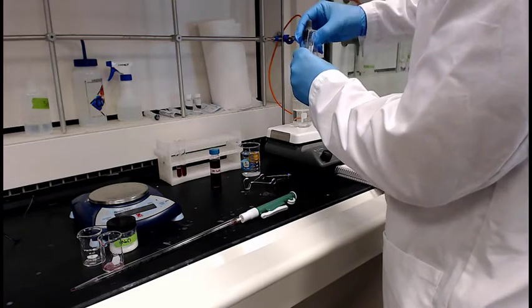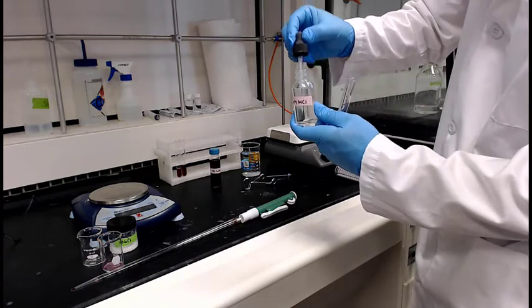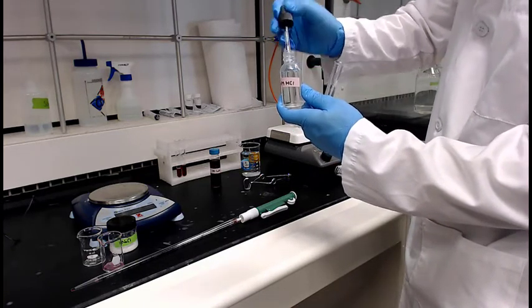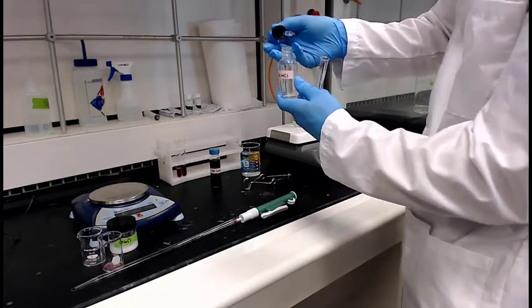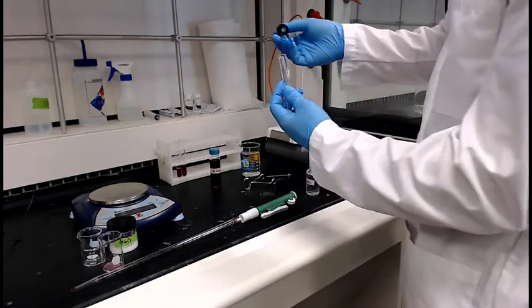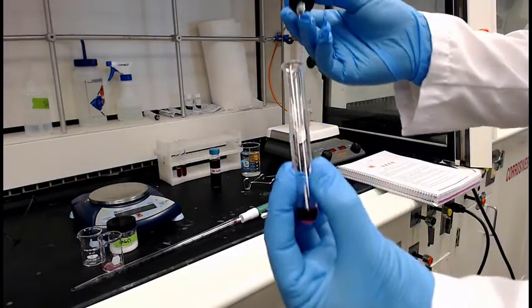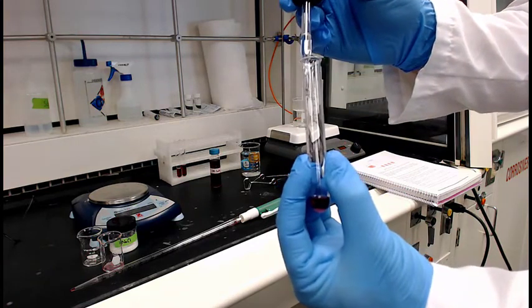So think about this, we're pushing chloride. We're going to add extra chloride ions to it. We'll see how dramatic this is. And actually it may pull it off, but he made a mistake, because really he's supposed to be adding concentrated, not 6 molar.